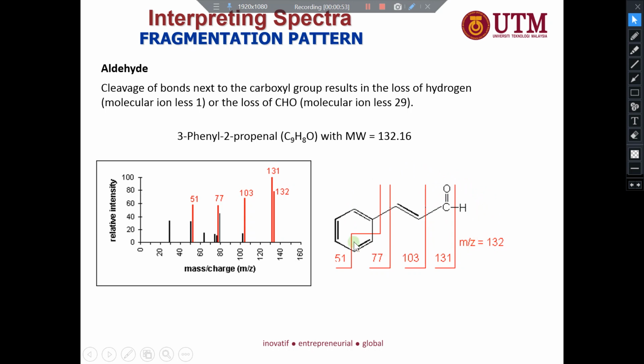Okay. Again, kalau kata untuk aldehyde, the most preferred one for the cleavage, after the C double bond O, dia akan potong dekat H ni, dia akan lost one lah, -1. Okay, ataupun dia akan buang C double bond O H kat sini. Yang ni the most common cleavage. The first one dia akan prefer yang ni, the second one dia akan prefer yang ni lah. Okay.